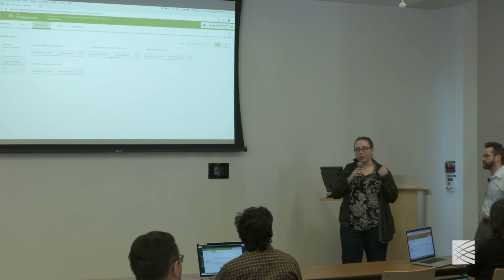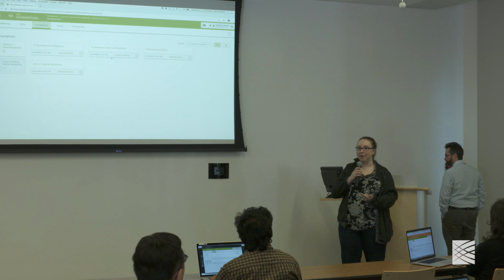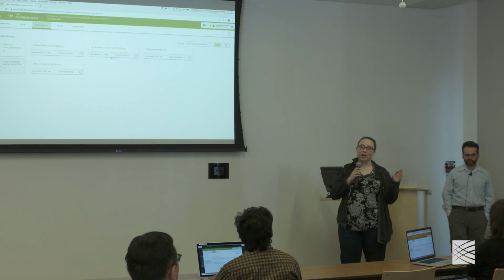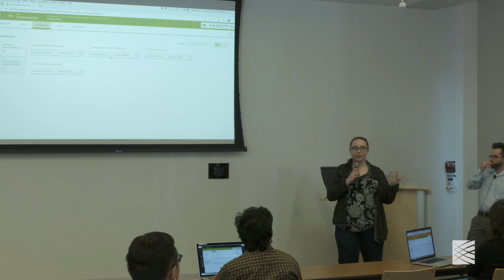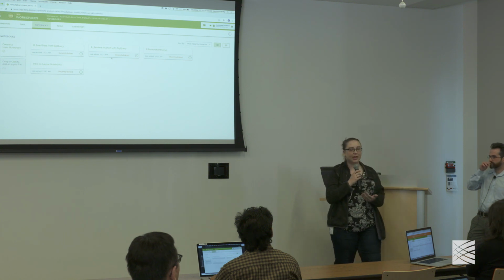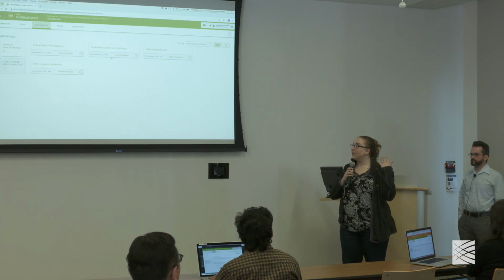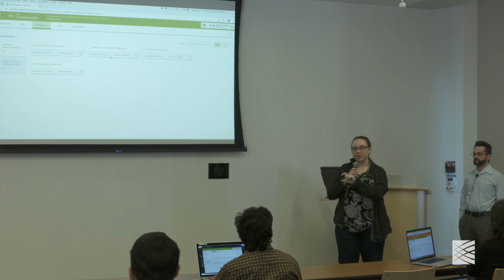For those of you whose free credits have expired, or you have been using the platform for a while, we added you to a billing project called Workshop-Temp. It's a billing project that goes on our budget so that you can run everything we're going to run today. We're not going to be running exorbitant costs. I think it's like 2 cents for a workflow later and maybe like $1 for the notebooks overall. So that's why we needed to add you to this Workshop-Temp billing project.